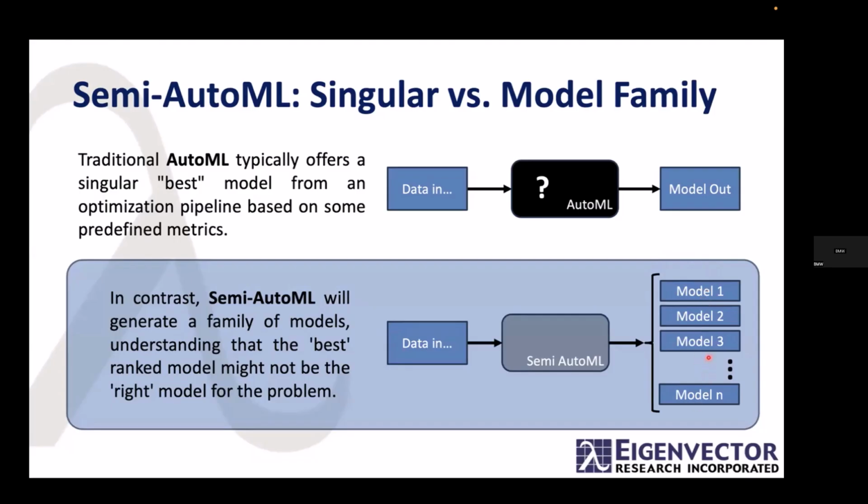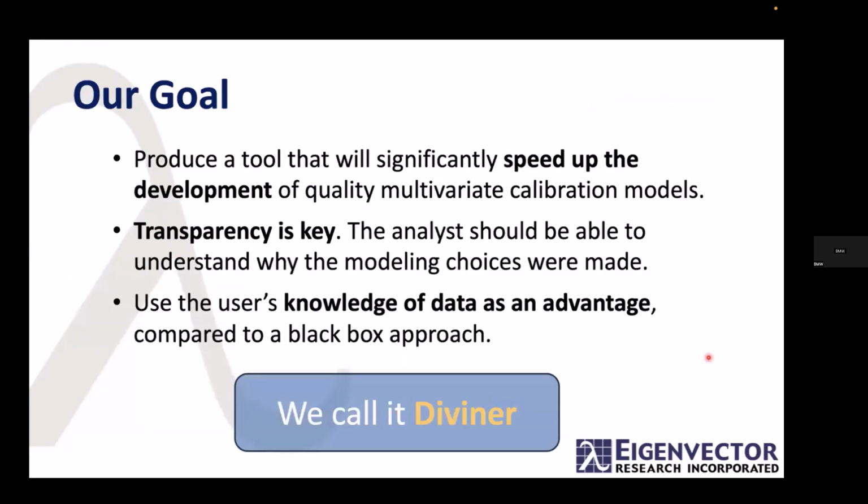This approach grew as we were working with Diviner and trying a lot of models, and you begin to see that there are a lot of models that are nearly equivalent in performance. So you wind up with a group of them that are all doing pretty well, and we sought to take advantage of that. We'll be talking more about that later.